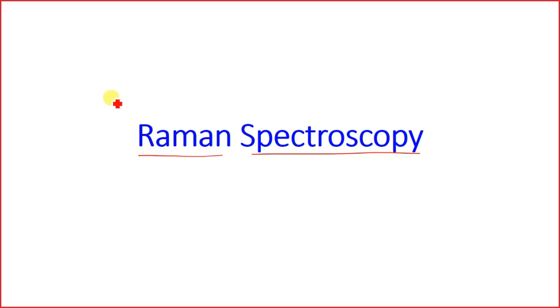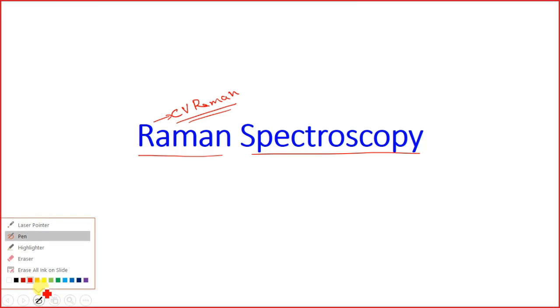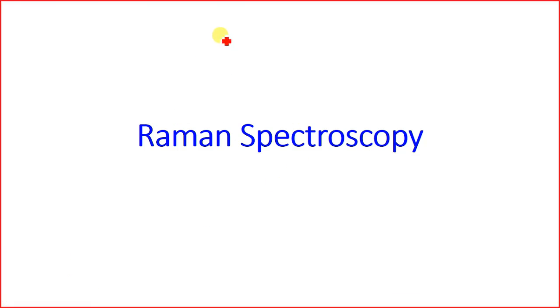Okay, so Raman spectroscopy was proposed by Dr. C.V. Raman from India. Before I enter into Raman spectroscopy, let's discuss the types of spectroscopic techniques we have talked about till now. So what was the first one? The first one was absorption spectroscopy.